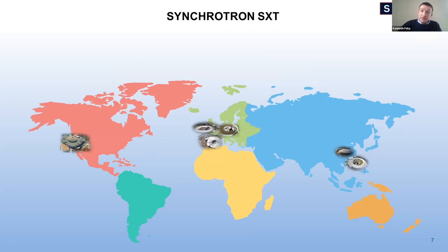And the utility of the technique has been validated at these beamlines, and there's very much growing interest in the technique. So we believe this is a good time to be rolling out a lab-based version. The benefits of a laboratory-based soft X-ray microscope will be on-demand access, as well as a greater scope for development of dedicated correlative workflow techniques that might benefit from soft X-ray capabilities.